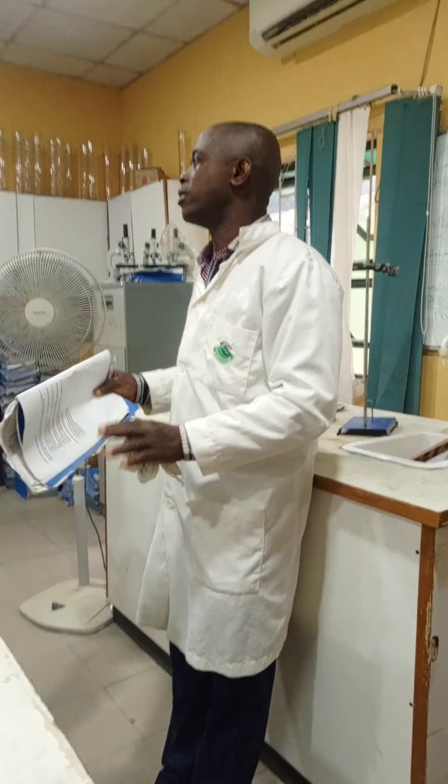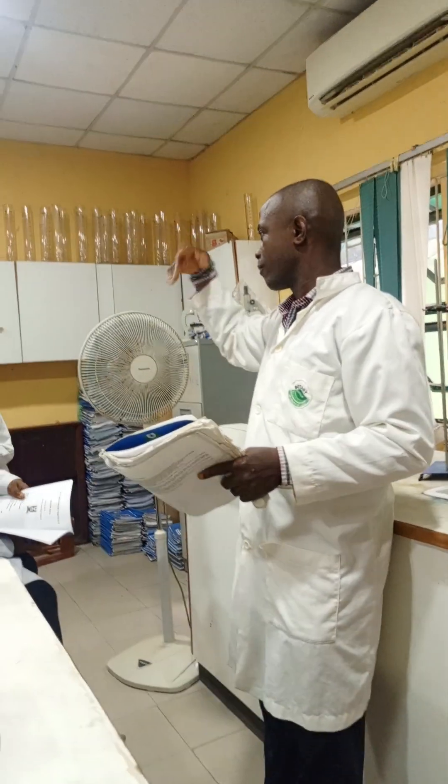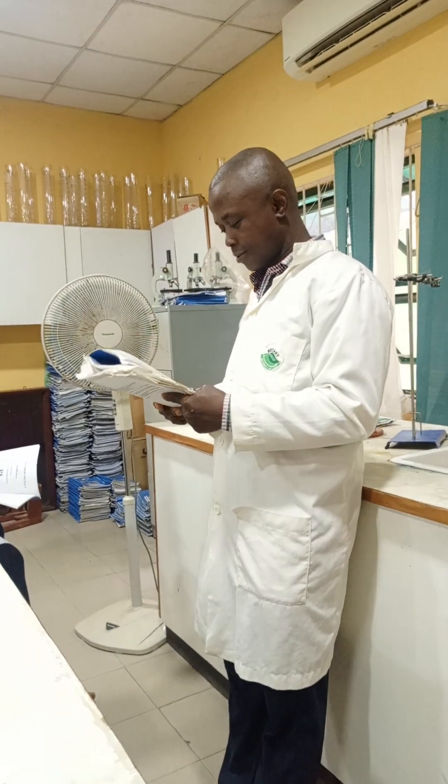There is no horseplay in the lab. If you have a friend who used to play around, tell them to be serious in the lab. You can play outside after the lab session.